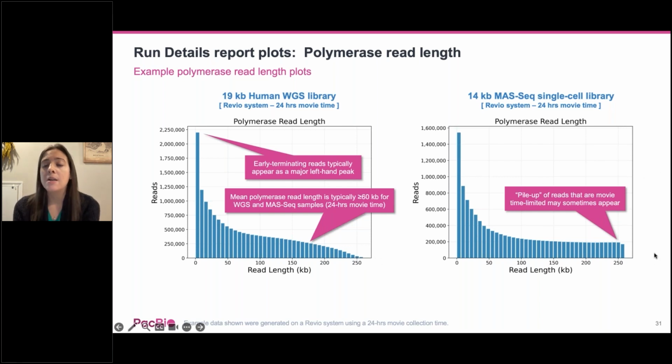And sometimes you'll even see a pileup of reads at 250 kb, and this represents polymerases that only stopped sequencing because the movie stopped at 24 hours.